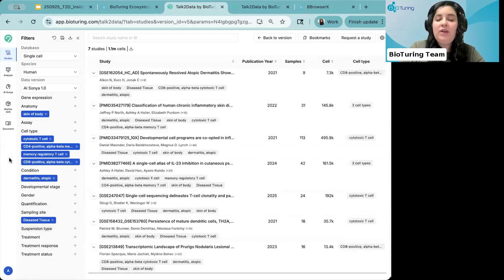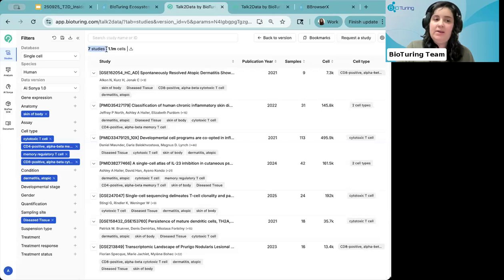At the moment, what I want to look at is very specific markers that I can determine are specific for cytotoxic T cells. Some markers might be more specific to these tissue resident memory T cells, and I want to be able to run this across the database. So you can see here that we currently have about 7 studies that particularly fit our criteria, both at the tissue structure level, at the cell type specific level, and also studies that would have information relating to the sampling site.